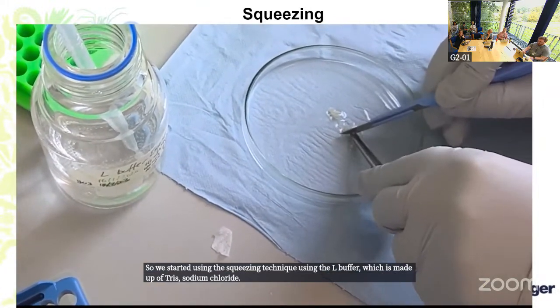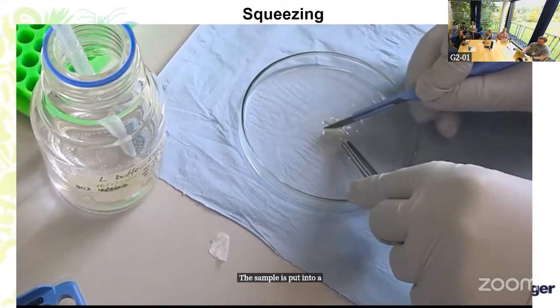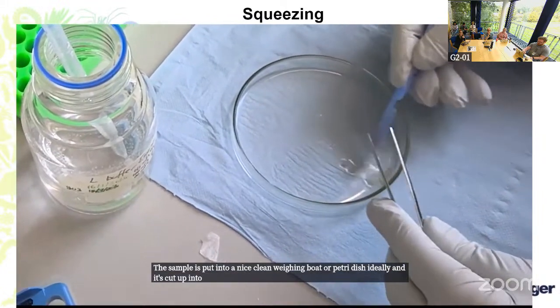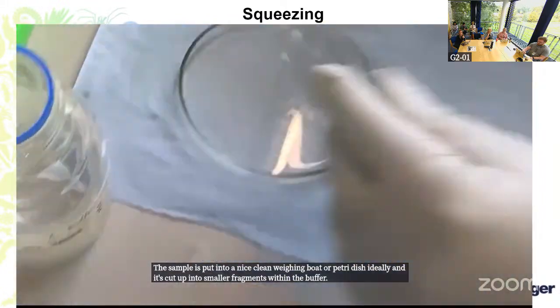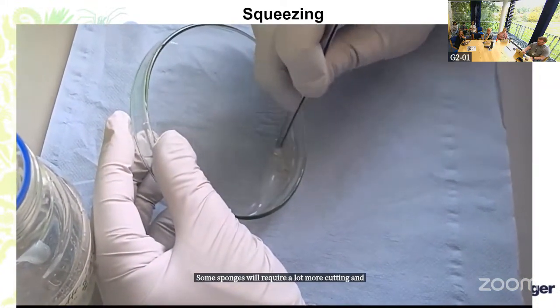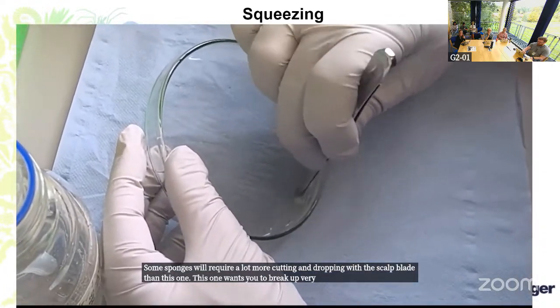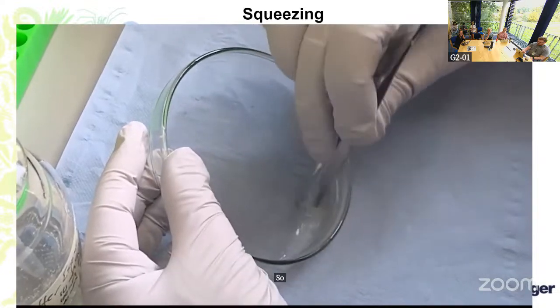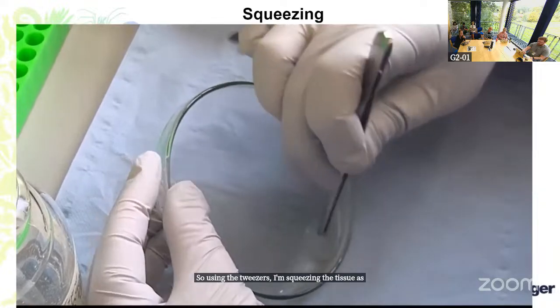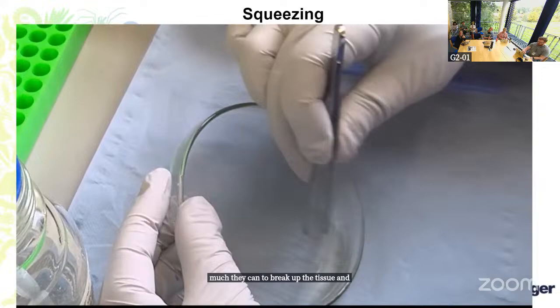and PBS. The sample is put into a nice clean weighing boat or petri dish ideally, and it's cut up into smaller fragments within the buffer. Some sponges will require a lot more cutting and chopping with a scalpel blade than this one. This one wanted to break up very easily into different small fragments. So using the tweezers, I'm squeezing the tissue as much as I can to break up the tissue and release the cells into the buffer.